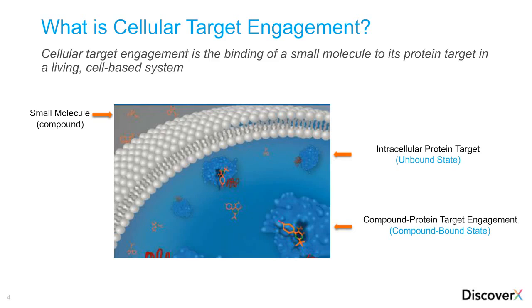It's a very simple concept described in the cartoon or the image. It's a small molecule compound. It's not looking at biologics such as antibodies or large proteins, because the small molecule compound needs to be able to enter the cell and then bind or engage to the intracellular protein target of interest.